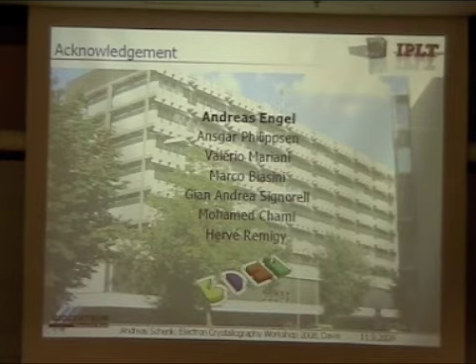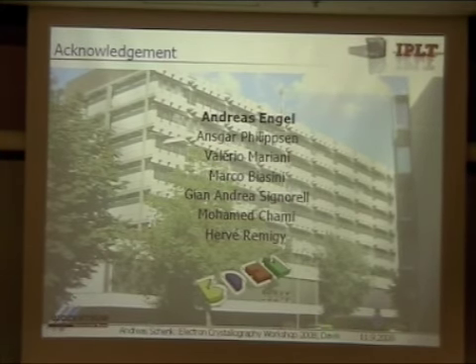I think you can probably answer that better. That's basically what Philip did in David's lab. Right. Yes. Tests have been made on simulated crystals and also on real crystals, to analyze the distortions and take that into account in using the CTF. As I understand it, you're looking at the classification, you're looking at the angular shift, and I wanted to get a sense of whether one method is more reliable than the other. This is too early.